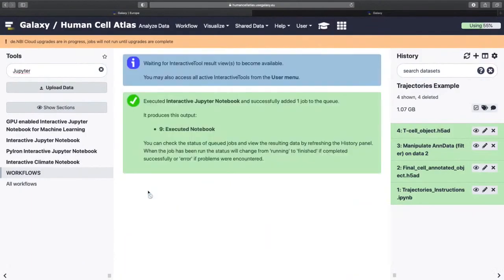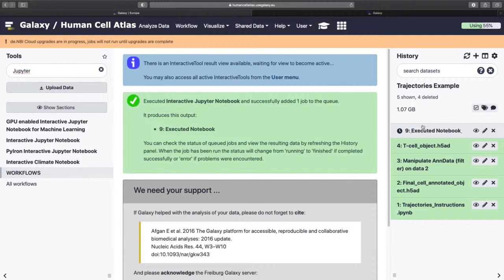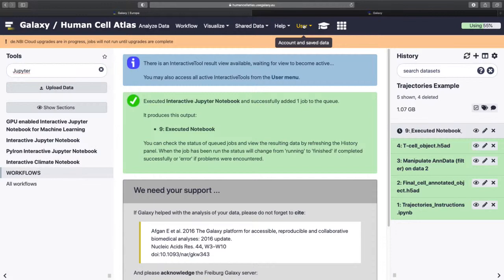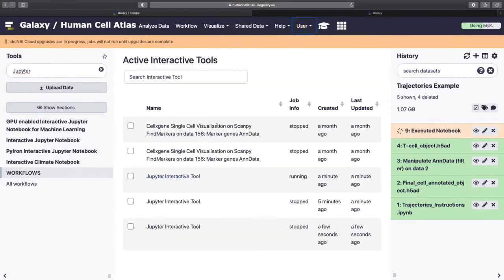Okay, we're going to start a fresh notebook. And this may take a little while, particularly if the server is incredibly busy. But just, you know, give it its moment and it'll appear. And it's orange. And it's here.